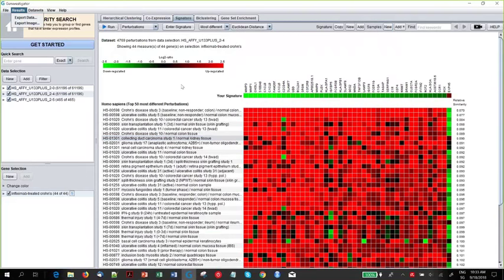Well, another way is that when we identify interesting data sets in Genevestigator, in a data-driven manner like now, we might want to dig down into those specific data sets and find out more because they're new to us. And so in our case, we found these two kidney cancer subtypes with an IBD-like expression profile. What are these subtypes? Which study do they come from? Are there other kidney subtypes included, etc.? We want to find out more about these particular studies because they're interesting and new to us.